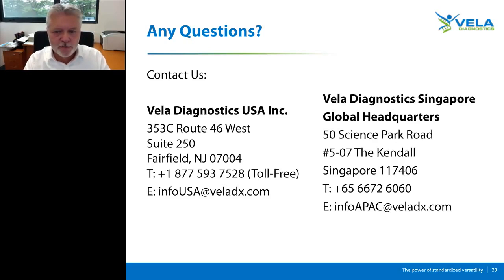significantly. And of course, you're saving a lot of cost due to the automation. This is one of the reasons why many laboratories become highly automated today. So it's a cost-saving factor in addition to the increasing quality.